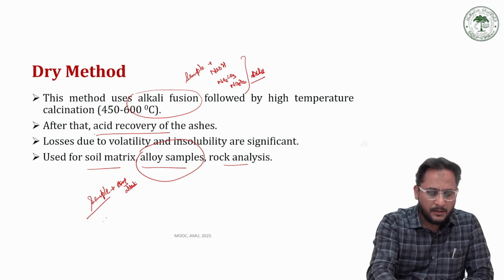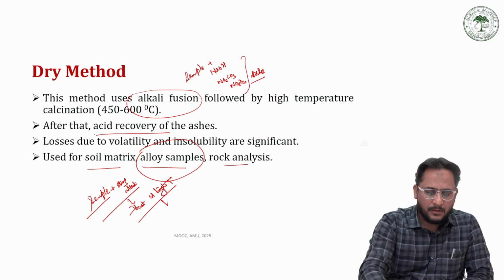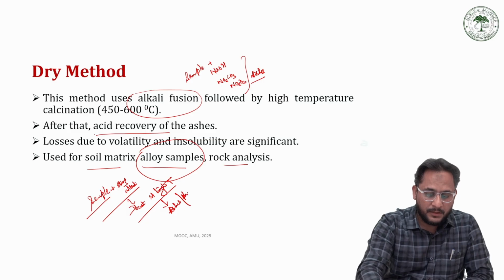and then heat the content at high temperature, so that it all burns into ashes, or is finally digested completely to form a paste or a powder.